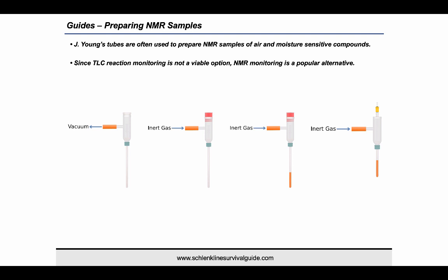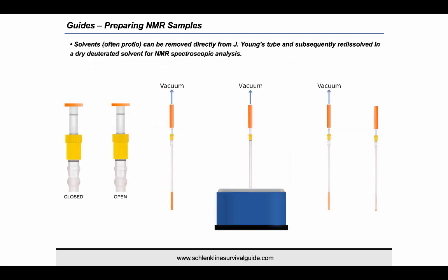Under a flow of inert gas, the Teflon tap is secured onto the NMR tube. This can be directly analysed using no-D methods or evaporated to dryness and re-dissolved in the deuterated solvent. To remove solvents from a J. Young's NMR tube, it is first attached directly to the Schlenk line tubing using the tapered glass adapter that is supplied with the tubes. The tubing is placed under vacuum and the NMR tube is submerged in a dewar of liquid nitrogen to freeze the sample. The Teflon tap is twisted to open the cap and evacuate the headspace of the NMR tube. After 2-3 minutes under vacuum whilst frozen, the Teflon tap is sealed and the sample is thawed. This freezing and vacuum process is repeated, but now the sample is removed from the liquid nitrogen with the Teflon tap open to allow the solvent to be slowly evaporated under vacuum. Once all of the solvent has been removed, the NMR tube can be backfilled with inert gas, sealed and then taken into a glove box or cycled back onto the Schlenk line to be re-dissolved in the deuterated solvent.